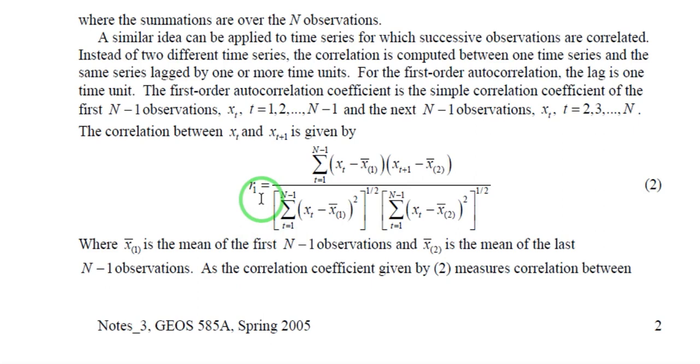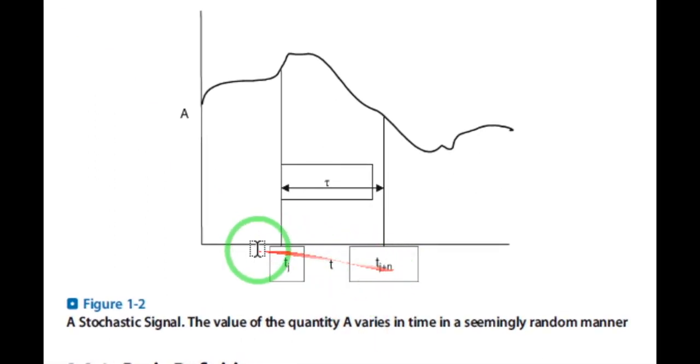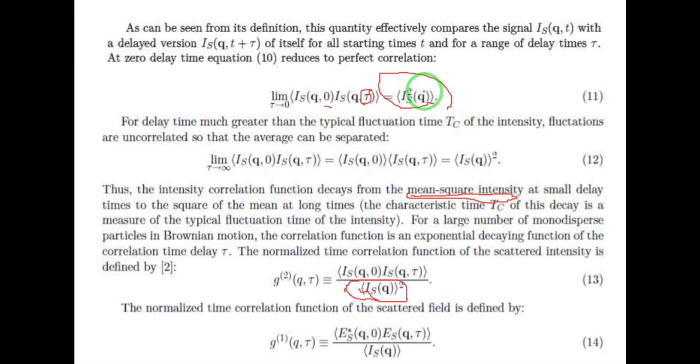Okay, remember, because this is really important. So I want you to remember that for the delay time of 0, these 2 points are completely overlapped, so the delay time is 0, and we come here, we will have the correlation value of the mean square, which is exactly stated here in this slide of Professor. You see here that we have the mean square.